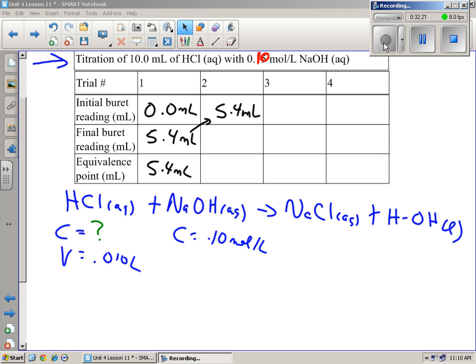Boom, right about there. Okay? So I should be able to add that very quickly. And if I stir this up, it should be gone. Okay? And it is. So I've taken that part very quickly. The next part is very slowly. Okay? You're going to do drop by drop.